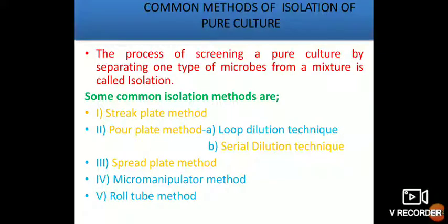Then, common methods for isolating the pure culture. The process of screening a pure culture by separating one type of microorganism from the mixture is called isolation. From the mixture of colonies, if you are isolating a particular colony or particular strain, that is called an isolation. Okay.